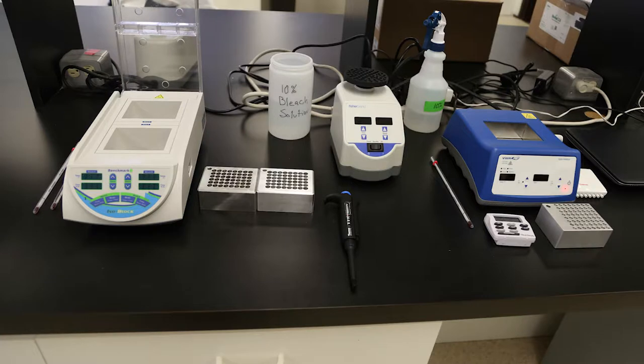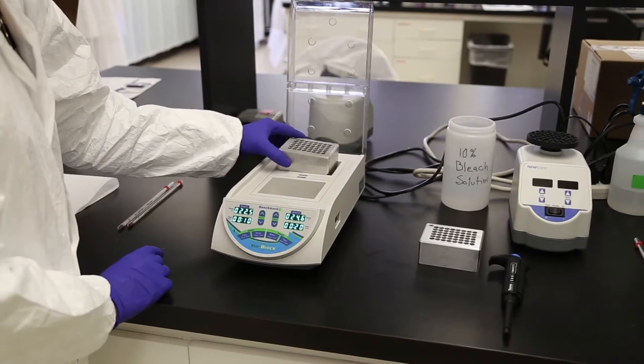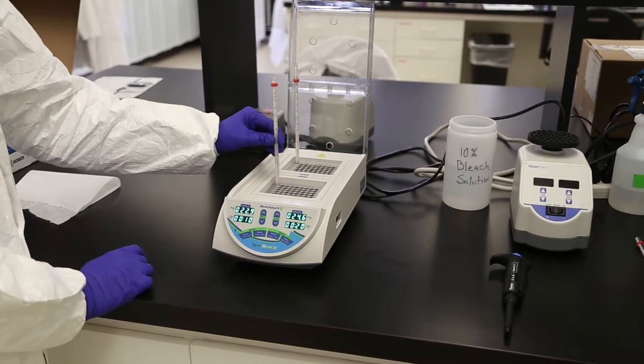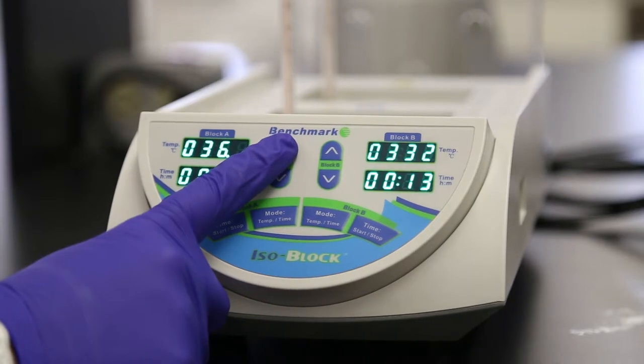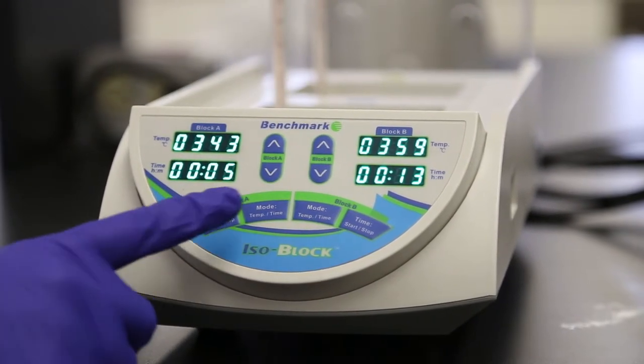Dry heat bath preparation. While the reagents are adjusting to room temperature, you can set up your dry heat bath units. This video demonstrates the setup of a Benchmark dual dry heat bath. Turn on the dual block's main power source. Fully open the lid and place a 48-hole aluminum block into each of the slots, then place a thermometer into the offset hole in the corner of each block. Press mode temp time for block A once to select the temperature setting. Using the block A arrow keys, press and hold up or down to adjust the temperature setting to 37 degrees Celsius. The block immediately starts heating.